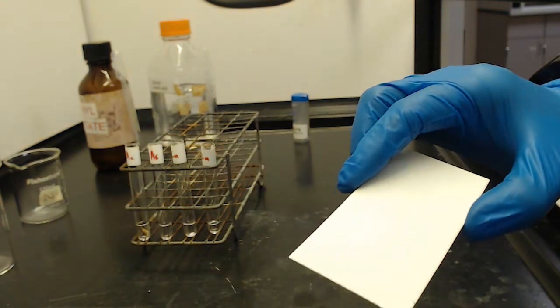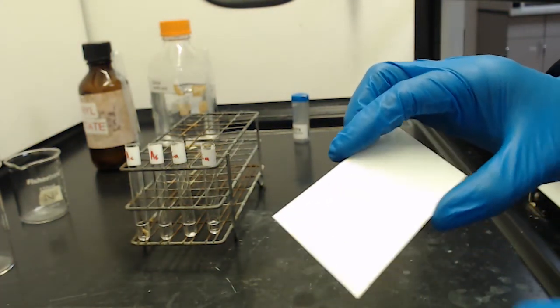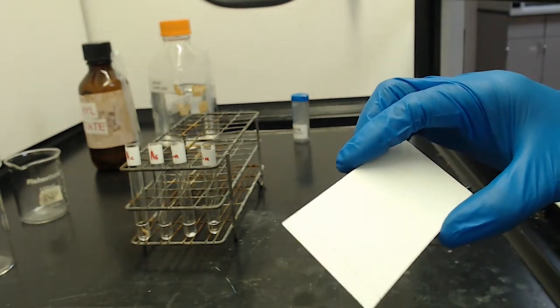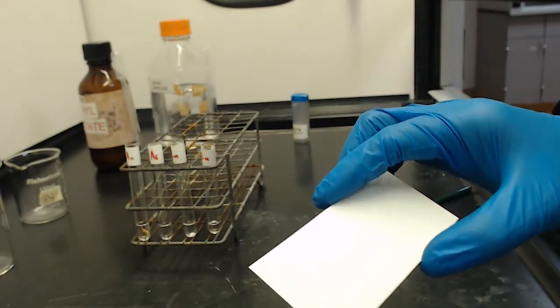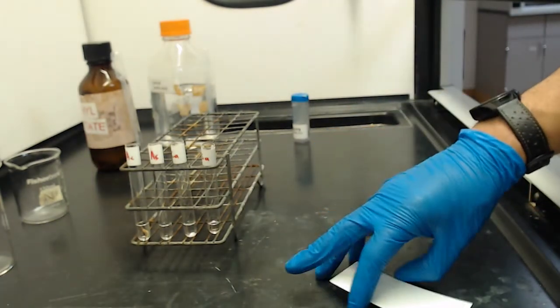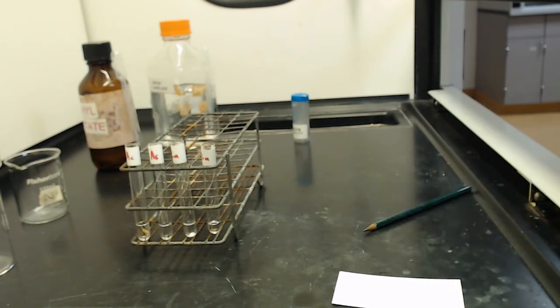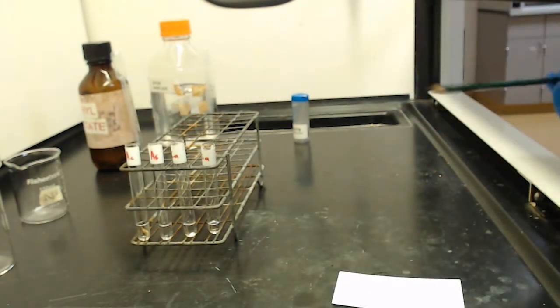Okay, and when I label my plate here, I want to label below that line. Sometimes people will put little etch marks where they're going to spot. I recommend against that because you actually disturb the silica on the plate when you do that. I'm trying to disturb the silica as little as possible. So I'm going to write the first 3 on there. I know the manual shows doing 5 samples on the plate, but this is honestly too small. I think 3 is ideal for a plate of this size. So I'm going to label it as AC, AS, and CA for this one.